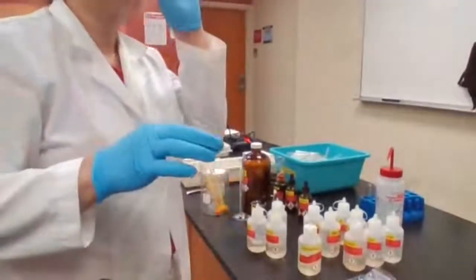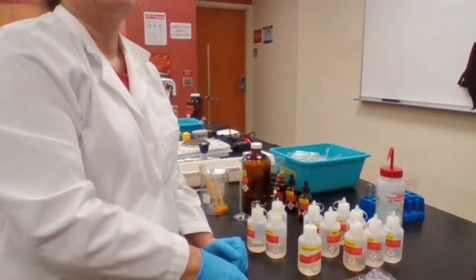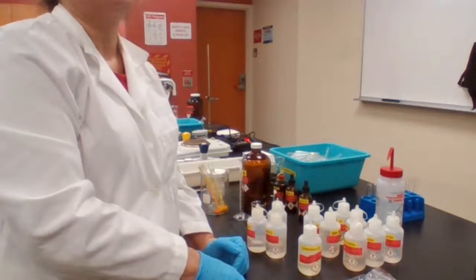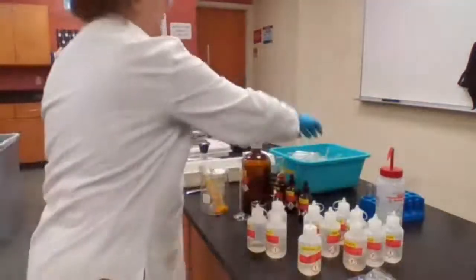With the iodoform test, for each of the unknowns, we are going to add 5 drops again, right? Which unknown should I use?